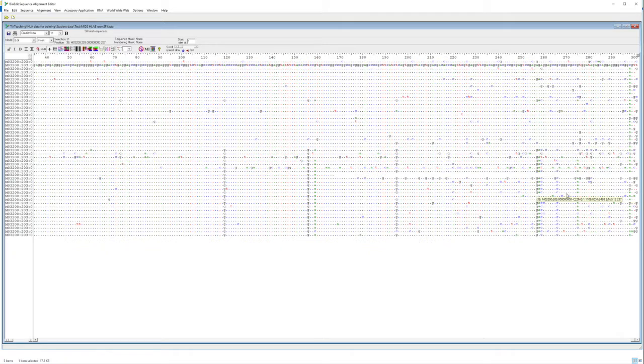The GACCA lines up with where the TG was, almost, but not quite. If I go up the top here, I can see I've got a GAC here, another GAC. This one's got a CA, I can see that here. And if I come back down to where the TGs were, I can see this one doesn't have the GACCA. It also actually doesn't have the G here.